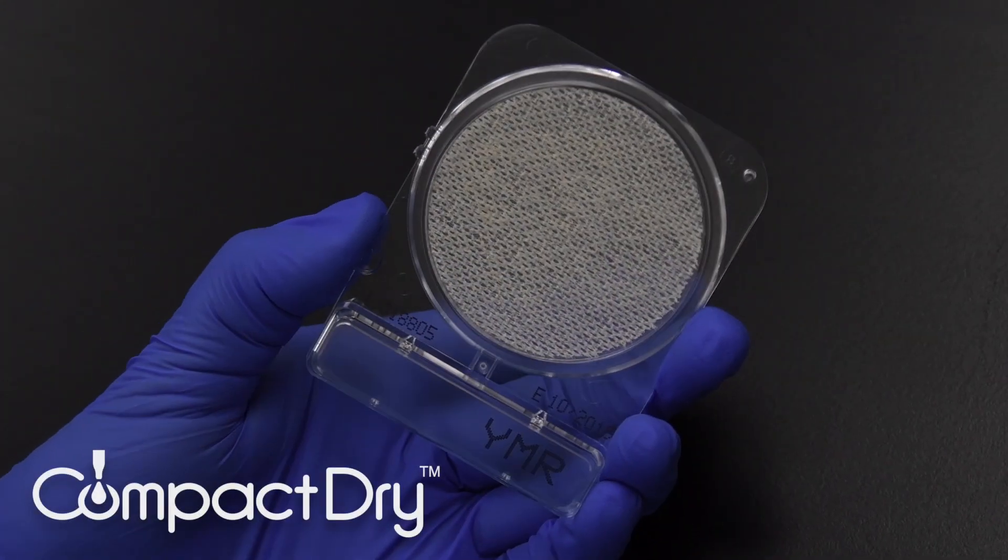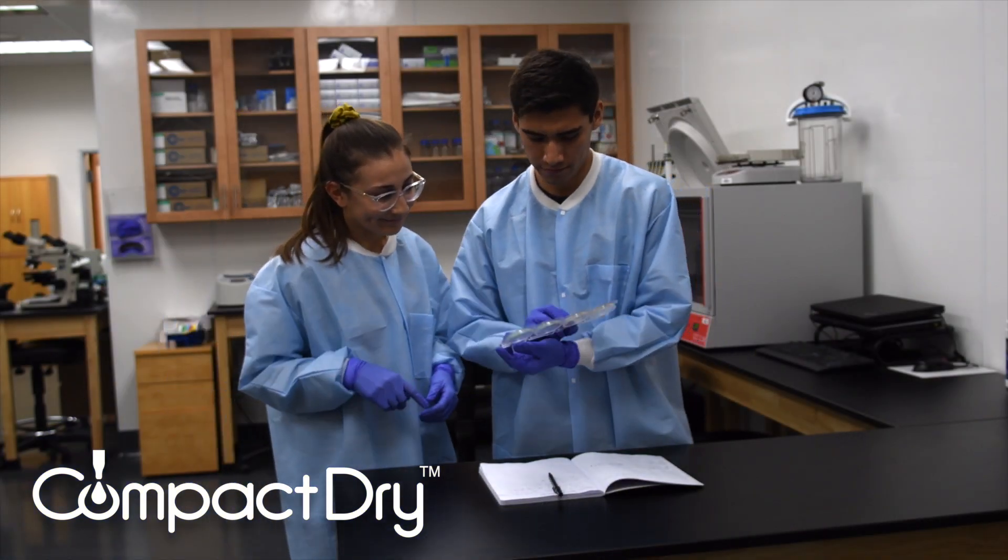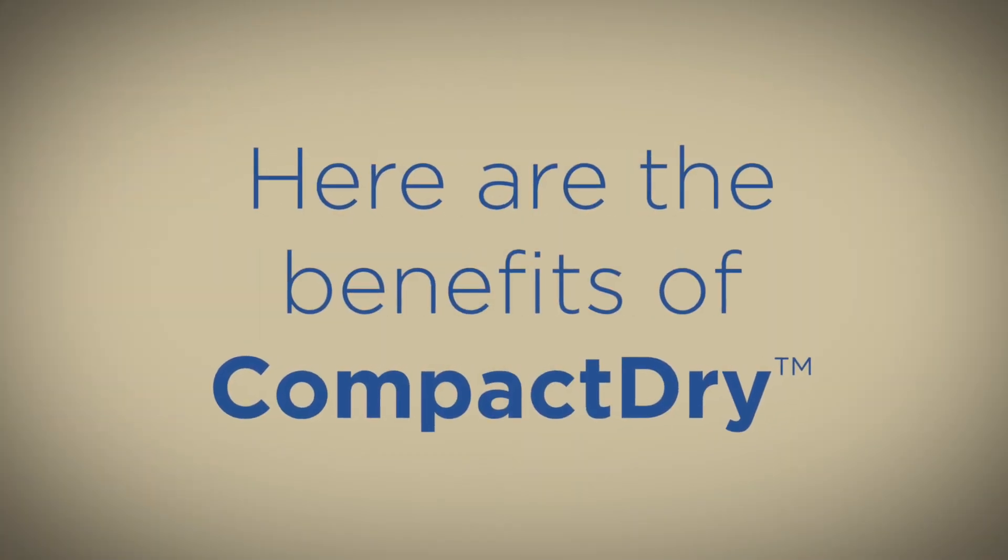The user-friendly nature of CompactDry allows for quick adoption into your lab, regardless of technician experience. Here are the benefits of CompactDry.